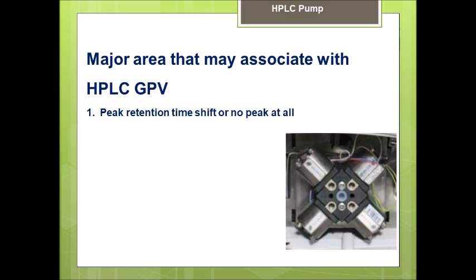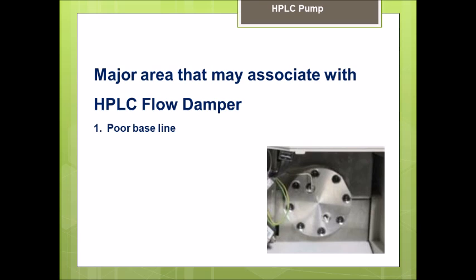The gradient proportion valve: the problem you're going to have is peak retention time shift or sometimes no peak at all, because the composition of the mobile phase that you're asking from the system and you have in your acquisition method, this gradient proportion valve is not able to deliver it. And the last one, the flow damper: you're going to have a poor baseline because it is not able to remove this oscillating motion of the pump piston and is not able to give you a steady or smooth flow.